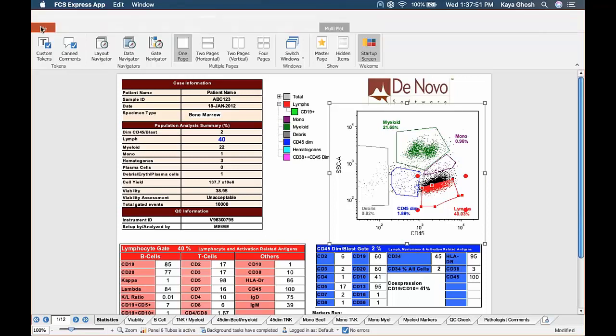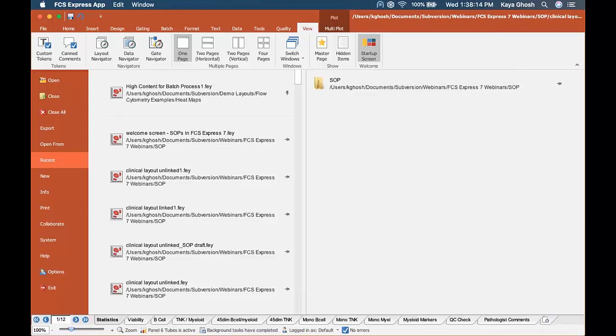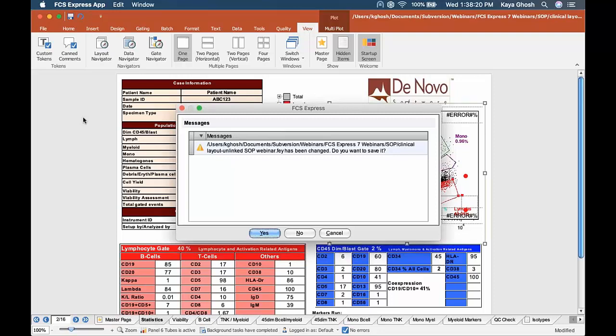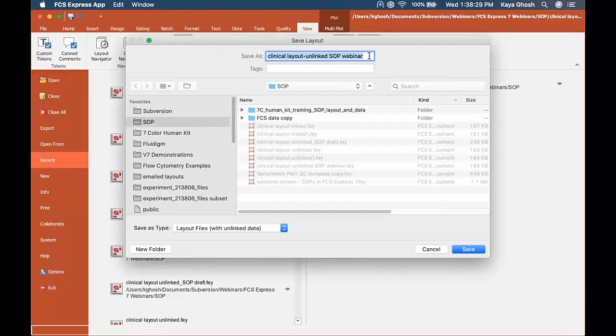So we're going to go File, Save As, we're going to say Unlinked, and I'll call this Clinical Layout Unlinked SOP webinar. So let's close and reopen that. I thought I did just save it. Let me just do that one more time. File, Save As. Yes, okay. Unlinked.